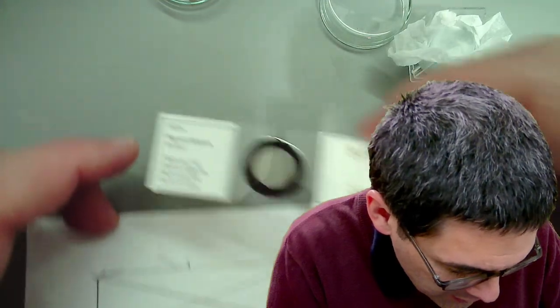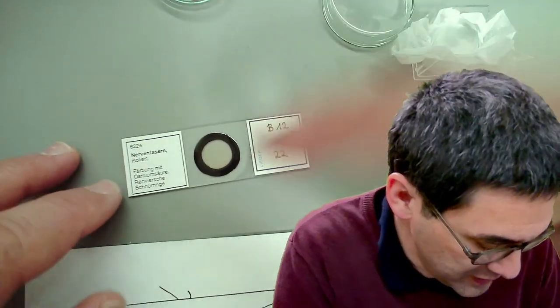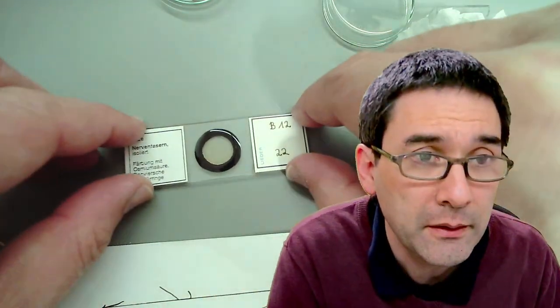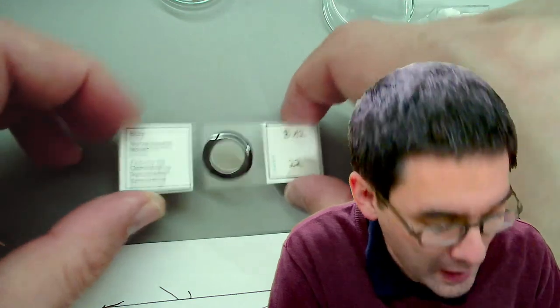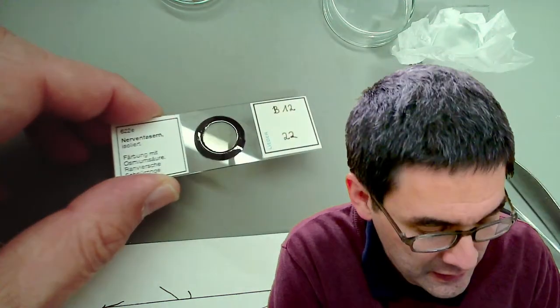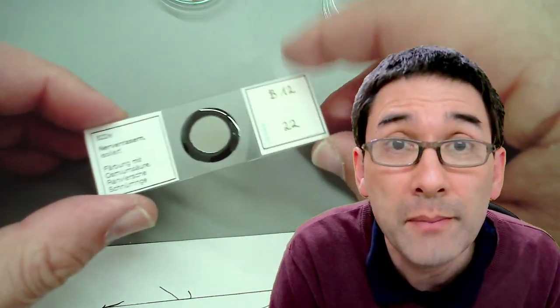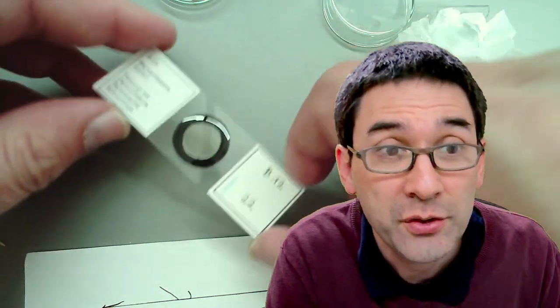So this is a commercial slide. It says here nerve fibers, it's in German, nerve cells. And the question is now: why is there this black ring around it? How did they put it on? They used the slide ringing table. Some weeks ago, I made a live stream about this. You're spinning the slide and you apply some nail polish around it.